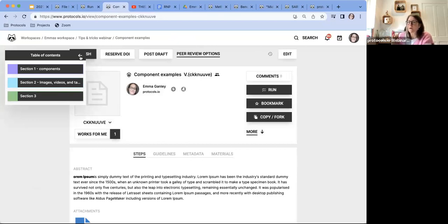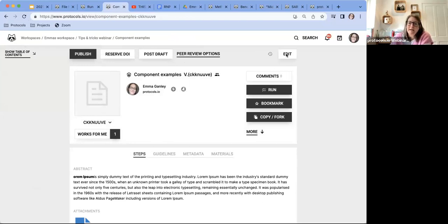If it's a big, long, comprehensive protocol, that means you can jump to wherever the relevant part is if you've kind of had a pause step overnight or something like this, or it's day 1, day 2, etc. We'll go back to edit.